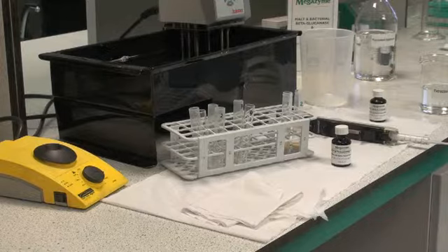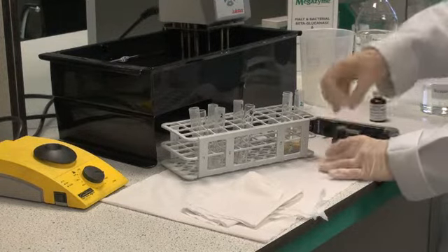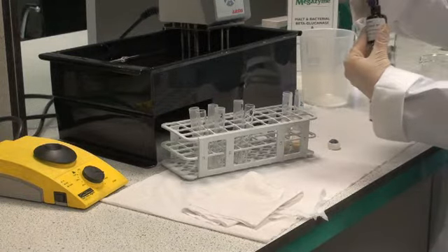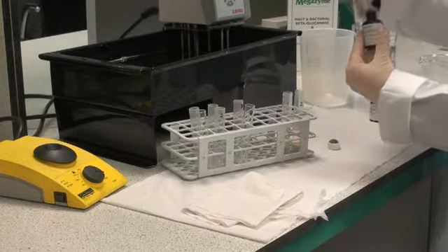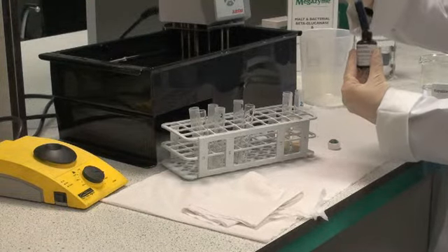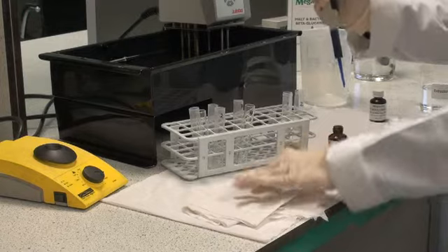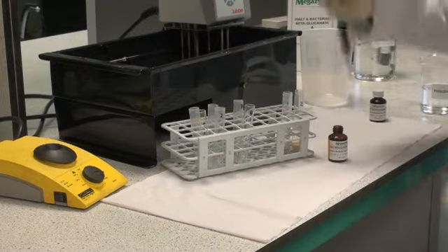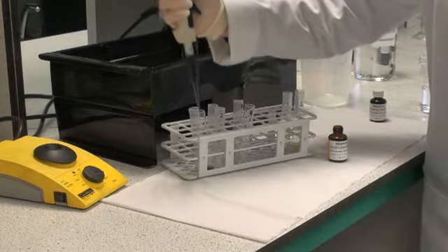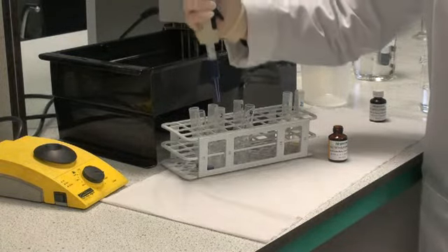With a positive displacement dispenser, dispense 0.5 ml of the azo barley glucan substrate into the reaction tubes and into two tubes to be used as blanks. This solution is viscous, so be careful when dispensing to use a positive displacement dispenser. Then dispense the liquid down into the tube.